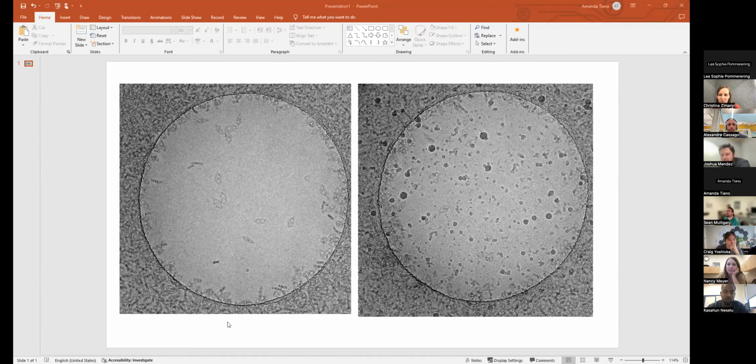Cryo box is most likely what it is, or there's a lot of contaminants inside the column that needs a good cryo cycle, like with heating elements. Yeah, okay.